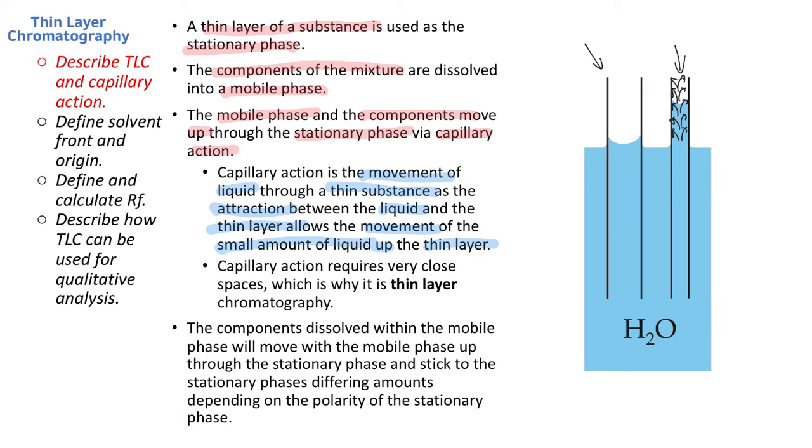Which is why it has to be thin layer chromatography, because without this thin layer, the capillary action doesn't work, right? You don't need to know much about it, but the idea is that the water is clinging to the sides, or clinging to the thin layer, and moving up the system. All right, so it's thin layer chromatography.